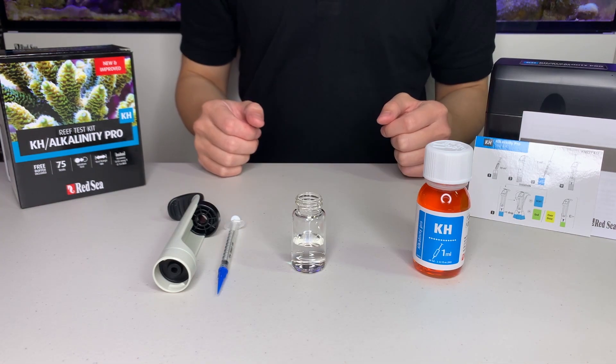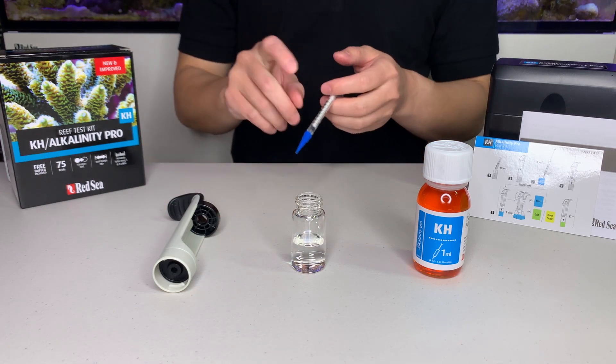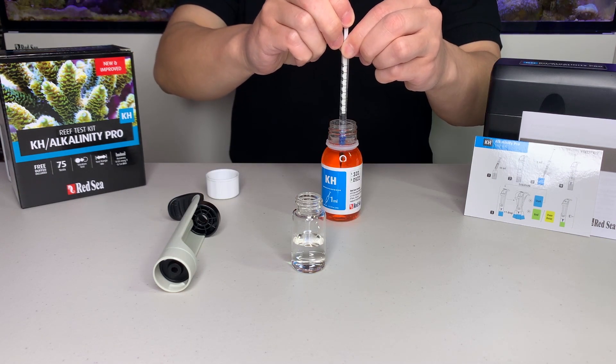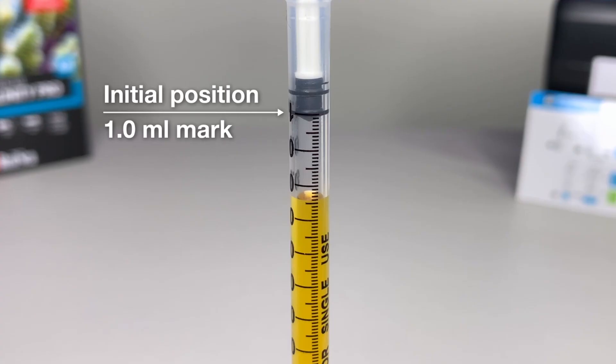We are now going to prepare the titration. Use the 1 ml syringe provided to take 1 ml of titrant. Make sure the bottom of the plunger is at the 1 ml mark. Here's a close-up so you can see where the plunger should be sitting.